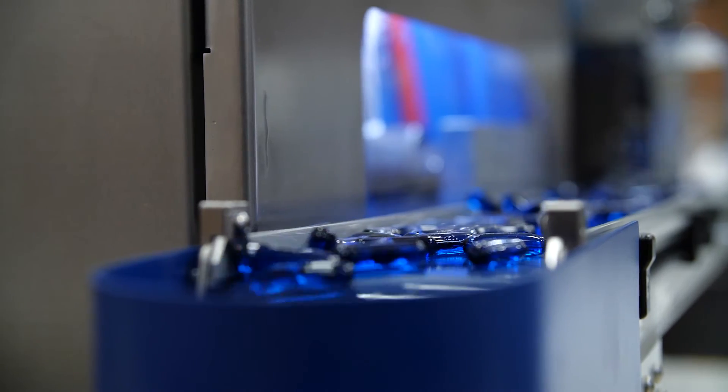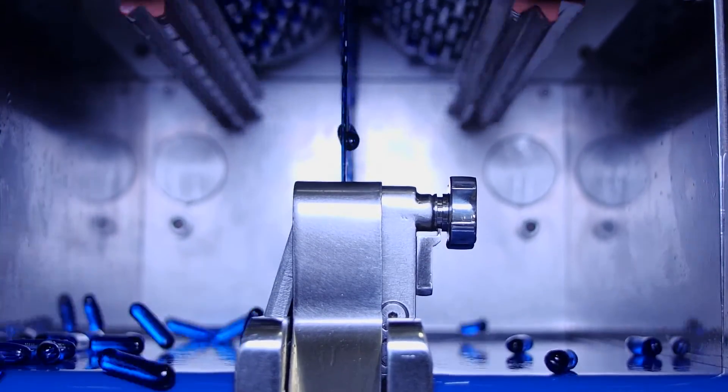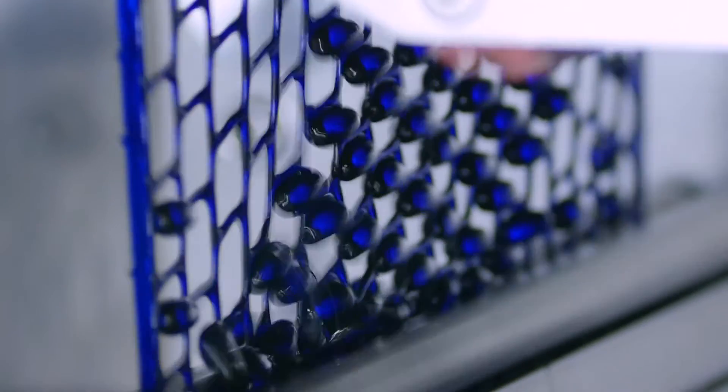The remaining gelatin from which the capsules have been cut, called the netting, is fed down through the stripper rolls and the adjustable mangle rolls, which pull the netting into a net collector.